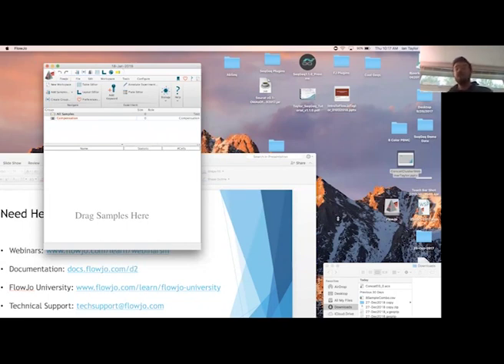And if you've done compensation through the compensation wizard in FlowJo, you might want to consider it, because that matrix won't be imported through the keywords of your data file. So yes, frequently we recommend choosing uncompensated parameters if you have an acquisition-defined matrix. Otherwise, compensated parameters can be just fine as well. You can also export your FlowJo compensation from a workspace and then re-import it, but that makes for a little bit more tedious process if you are having to do that.